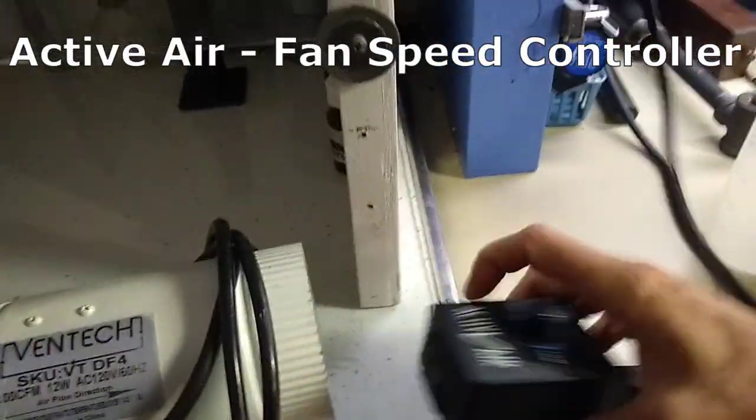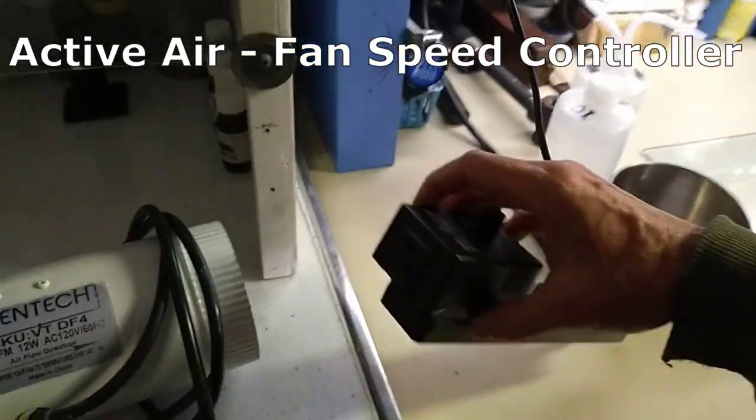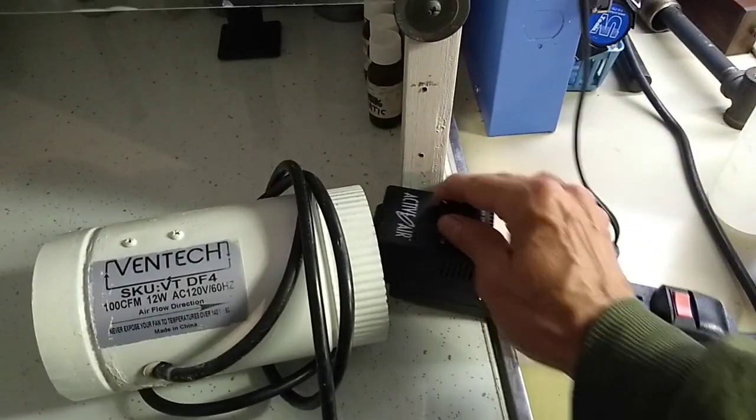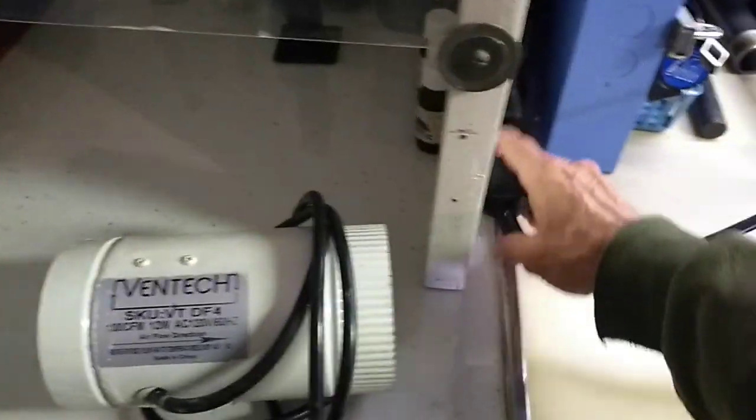You basically plug it into an outlet, and then you plug the fan into the back here. I just unplugged it so I can pull it out to show you. And then it has a speed control, so I can dial that in exactly where I want it, depending on how wide open I have the plexiglass here.